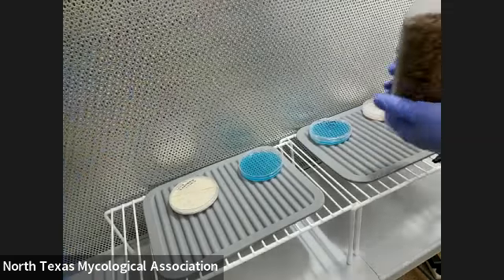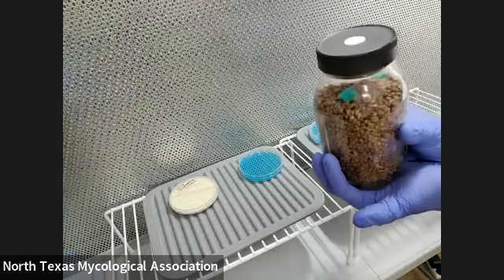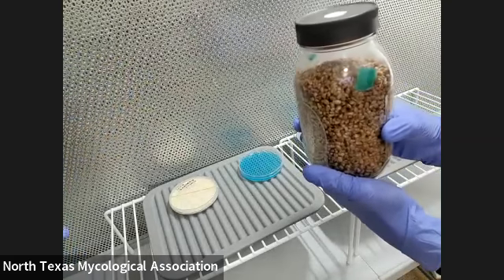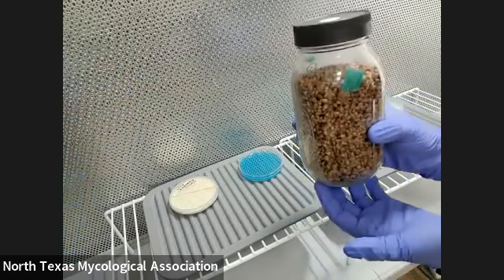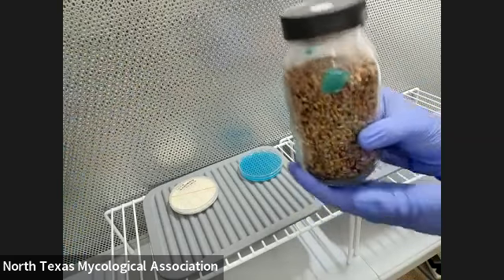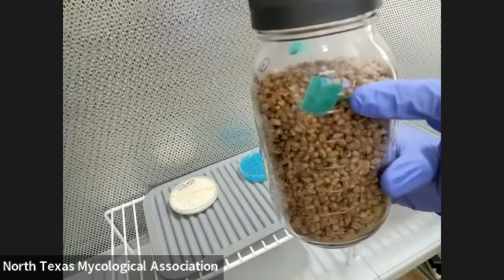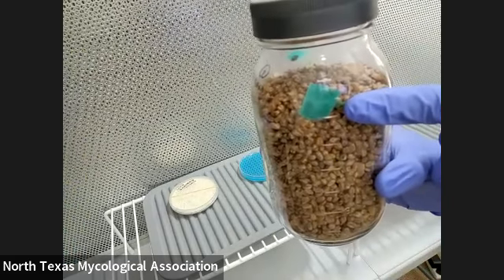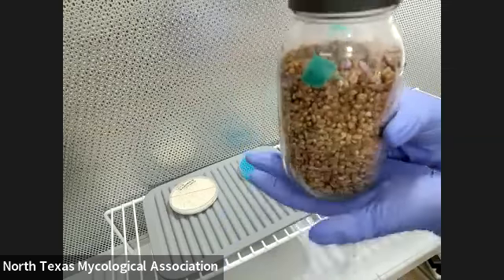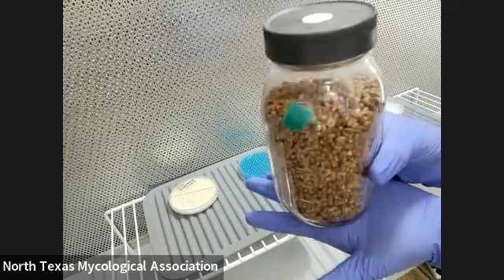I'm also going to show them how to do an agar-to-grain transfer. It's the same thing, but instead of transferring to an agar plate, you're going to put it to grain. You see how there's an agar piece in there? What kind of grain are you using? I'm using whole wheat. You can use whole oats, rye berries — you can use a bunch of things.